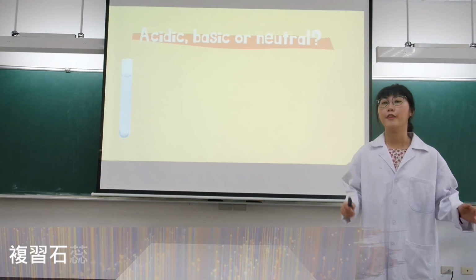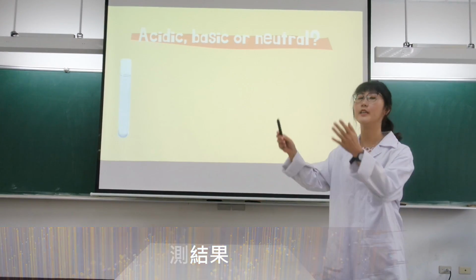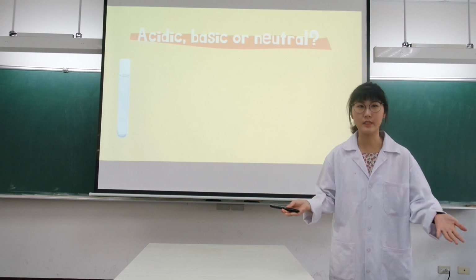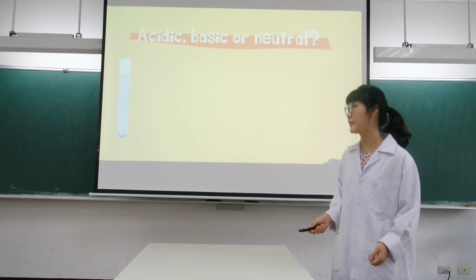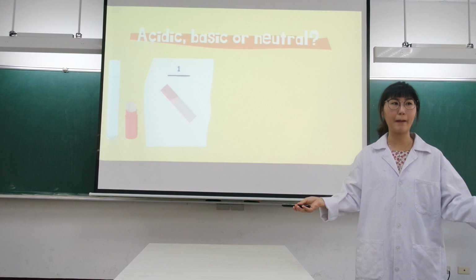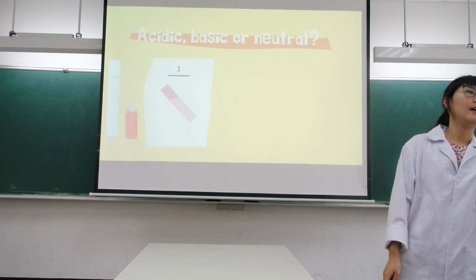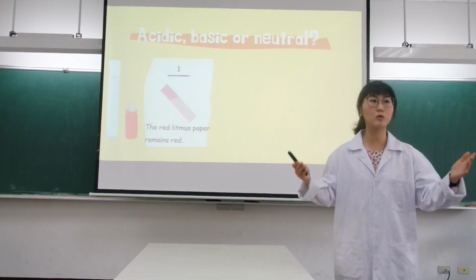Very good. There is a kind of solution, and I want to know if it's acidic, basic, or neutral. What can we use? Yes, very good. Litmus paper. So today I'm using the red litmus paper, and what happened? Group 3, can you tell me? Oh, that's right. The red litmus paper remains red.